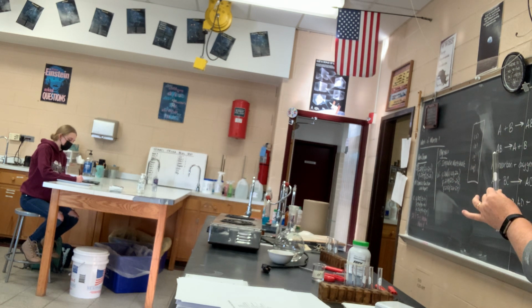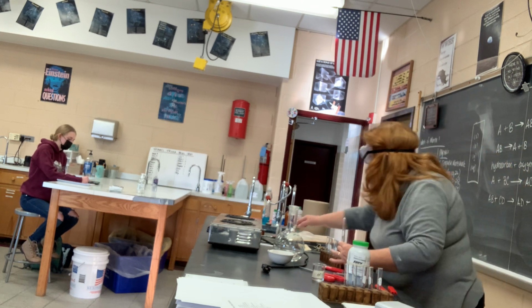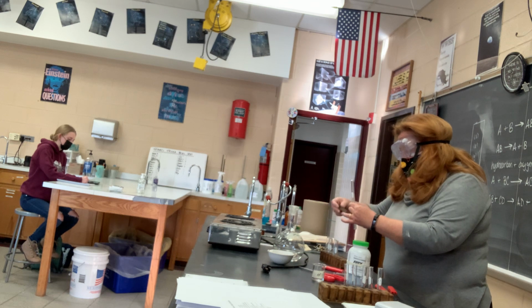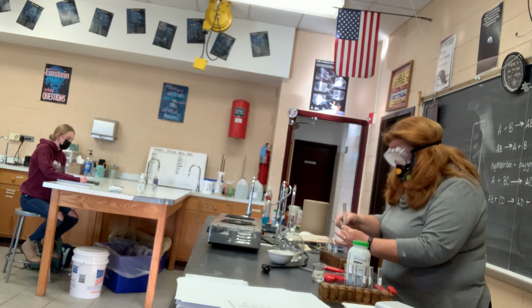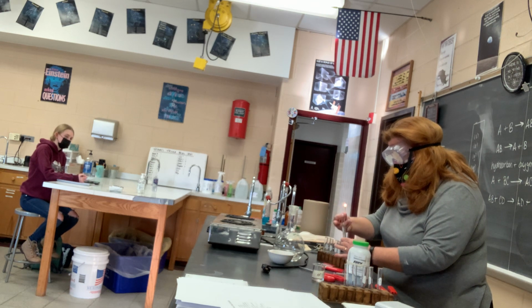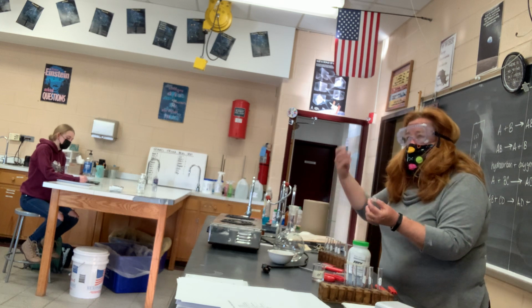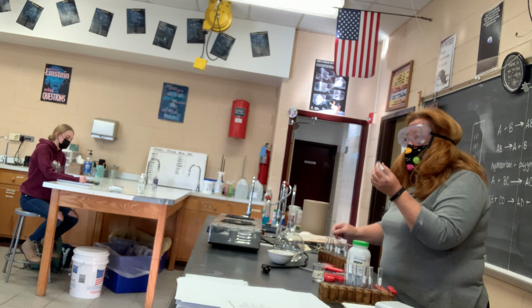And as I'm trapping it, then we light it on fire. I don't know if I've trapped enough. Did you hear that? It usually makes a cuter popping noise, but that noise means there's another chemical reaction.